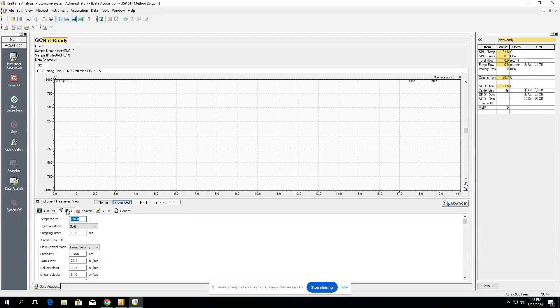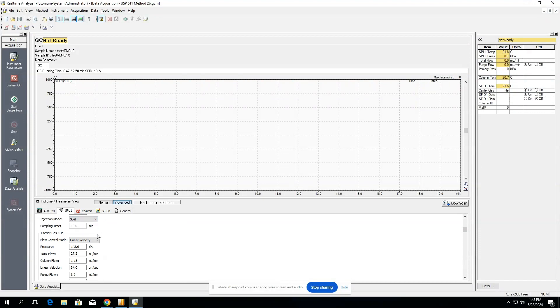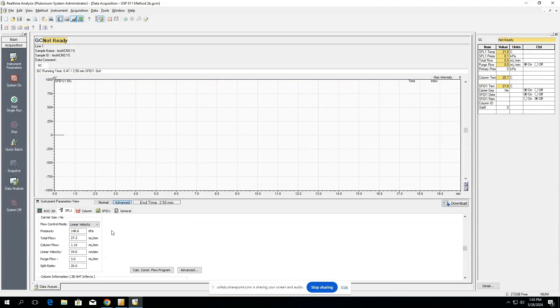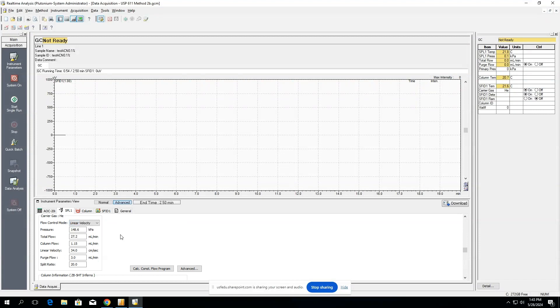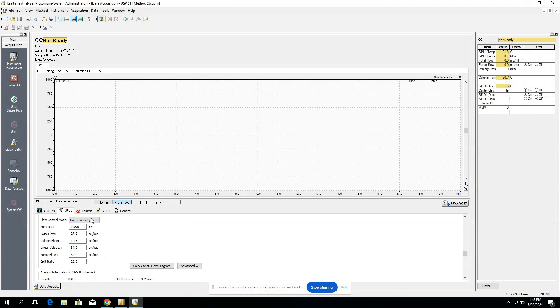First we can start with the injector and we can set whatever temperatures to whatever they need, whether it's split, splitless, or direct, as well as the flow control mode, whether it's linear velocity or pressure. Typically we'll keep it as linear velocity and control the linear velocity as the method states, as well as input whatever the split ratio is.